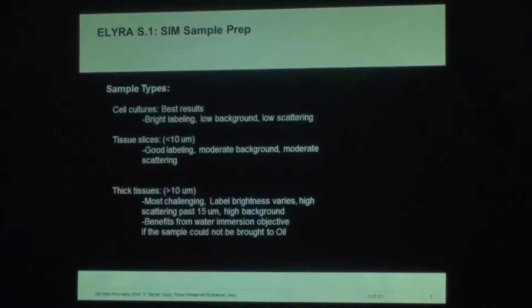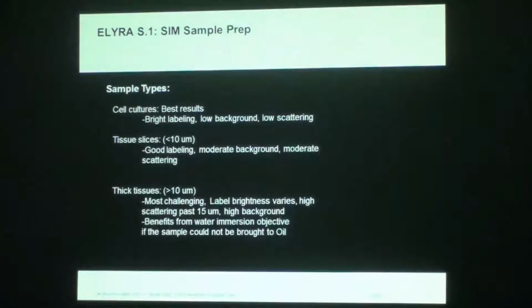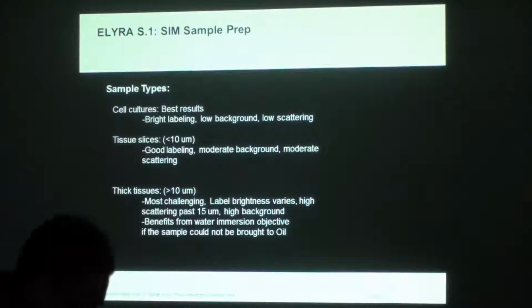But your resolution improvement is only twice in the structural illumination in the XY. So looking at the sample prep briefly, obviously like any other microscopy technique, these are pretty standard. When you look at this, you might laugh at me because there is no optimal sample you can make like what we wanted you to make, because it's hard in a biological sample.